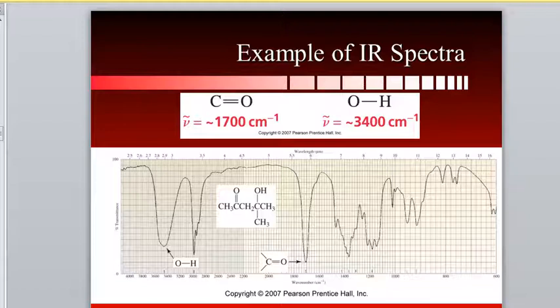And this is what we call a spectrum, an infrared spectrum. Okay, we saw spectrums when we analyzed compounds on UV-vis. The difference is that this spectrum looks a little different, right? Instead of the humps pointing up, these humps point down. In the beginning, I see a flat line, and then we see a dip, and then it comes back up.